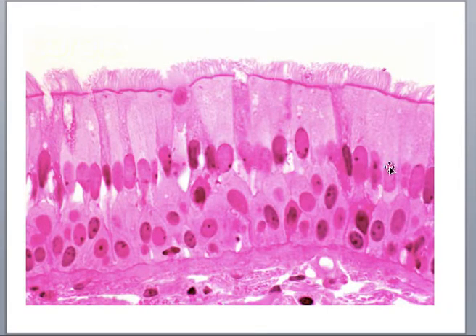Here's another super beautiful image of pseudostratified columnar ciliated epithelium. You can see it has definitely a columnar appearance. They're very tall cells, apical surface. This apical specialization, look at the really long finger-like projections. Those are cilia. Down here would be the basement membrane, and this would all be connective tissue below.